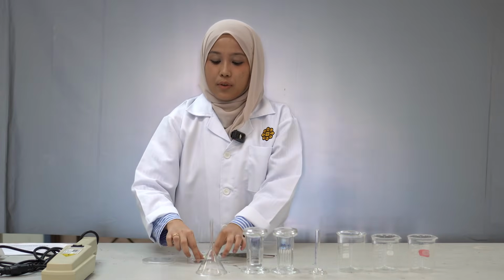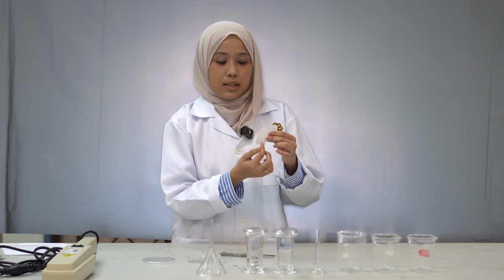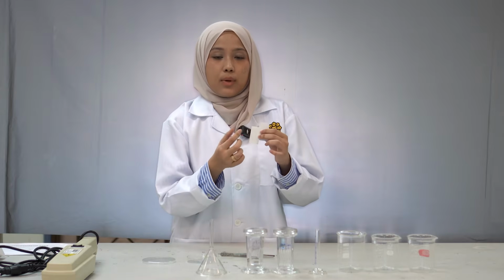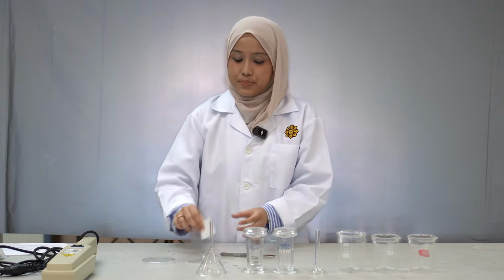Next, we will prepare the TLC plate. For the TLC plate, we will draw two lines: first, 1 centimeter from the bottom, and another 1 centimeter from the top, and we also label it A, B, and N, which indicate acid, base, and neutral.